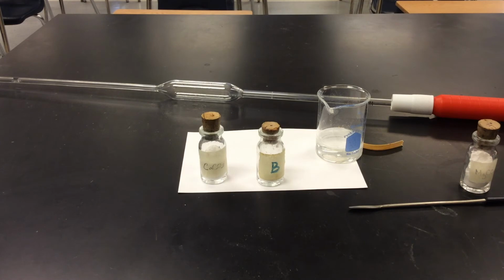Some students want to pour out 1 gram and go from there, and I say, well, what if you need more than 1 gram? More measurements that you make, more error you introduce. So using the bottle and just adding the amount that you need until the reaction stops is usually the best procedure.